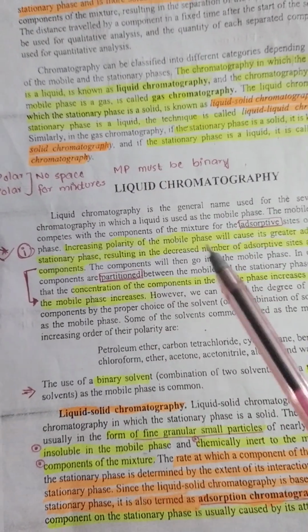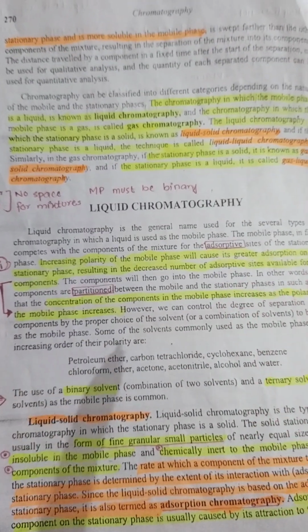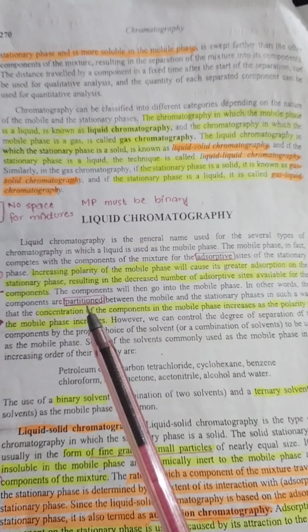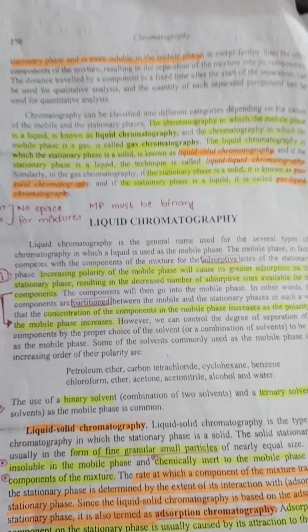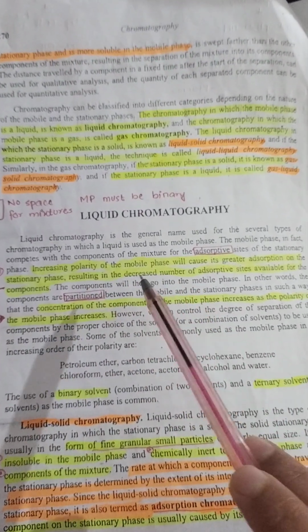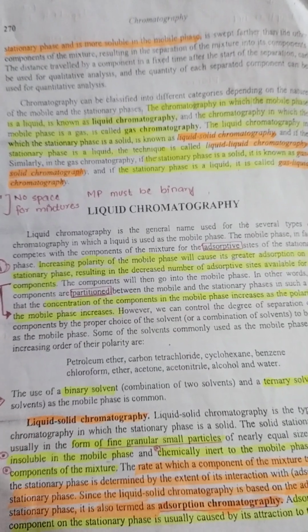Okay, now there is an important point mentioned here: increasing the polarity of the mobile phase will cause a greater adsorption on the stationary phase, resulting in a decrease in the number of adsorptive sites available for the component. If we increase the mobile phase polarity, there is greater adsorption on the stationary phase, because our stationary phase is also polar, resulting in a decreased number of adsorbent sites available for the component. There is no space left for the separation of our component.